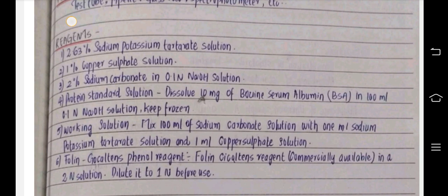And working solution: mix 100 ml of sodium carbonate solution with 1 ml sodium potassium tartrate solution and 1 ml copper sulfate solution.